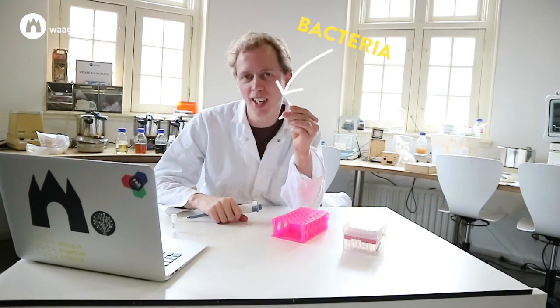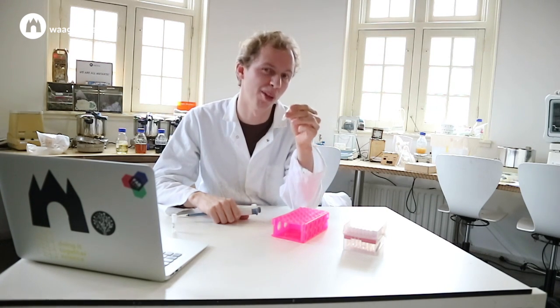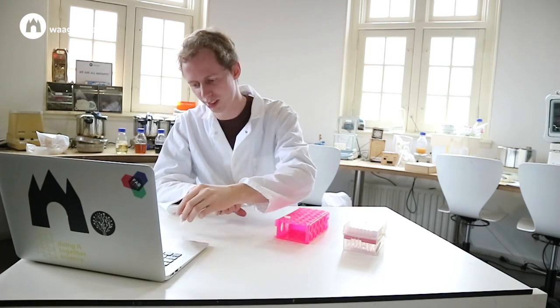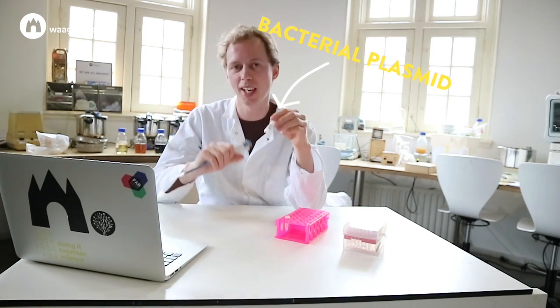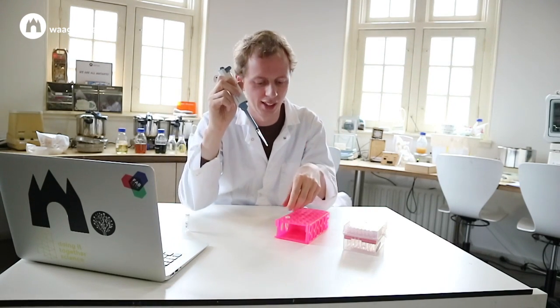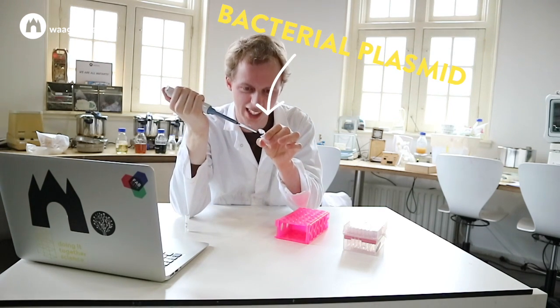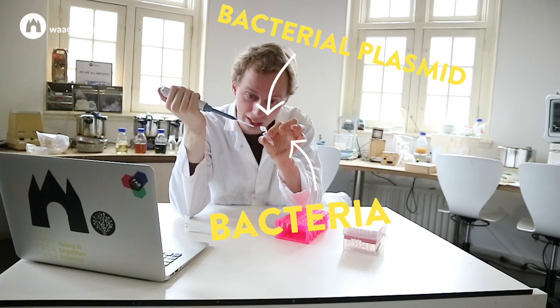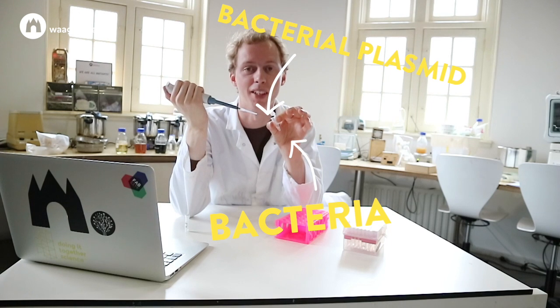You have to prepare some bacteria by heating them up with a transformation mix. By doing that the bacteria are able to absorb DNA. From this tube from the kit, which has bacterial plasmid, you take a tiny droplet with a pipette. And if I would now add this droplet to this tube — and actually make these two droplets meet — that is actually considered genetic engineering. And if I do that without a permit, I would go to jail.